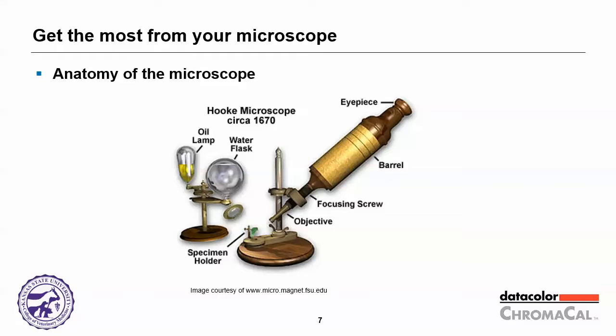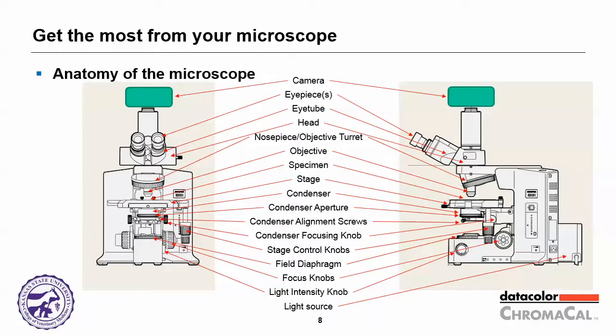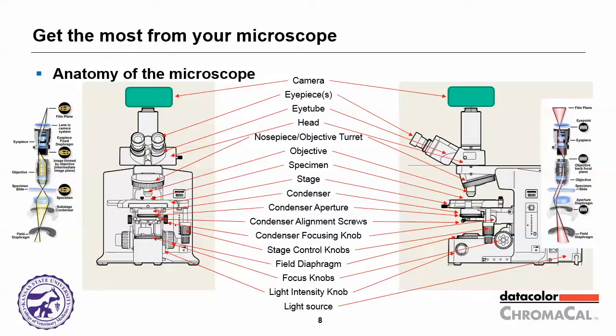So if we take a look at the anatomy of the microscope, or maybe not that microscope, but this one. Most microscopes that we use have very similar components, and inverted is essentially upside down of this. But then we take a look now at the optical paths, and they do overlap nicely. Key elements are the field diaphragm here at the bottom. The specimen plane is clearly here where the specimen is located on the stage. And then you have other image planes, one up on the sensor, one in the eyepiece, the back of the eyepiece.